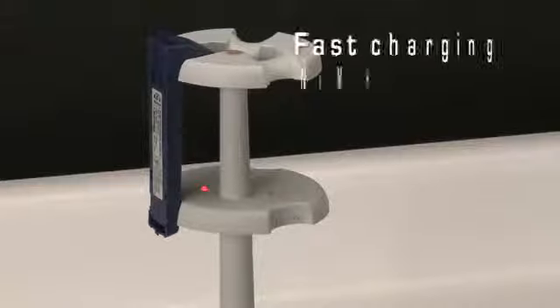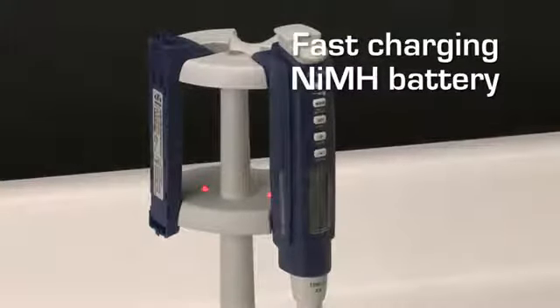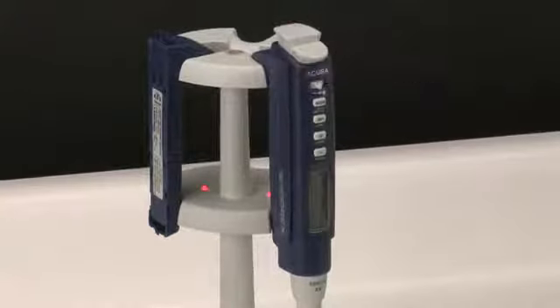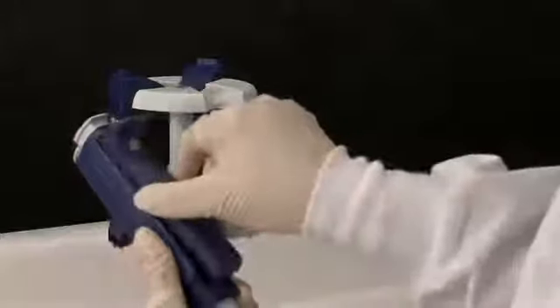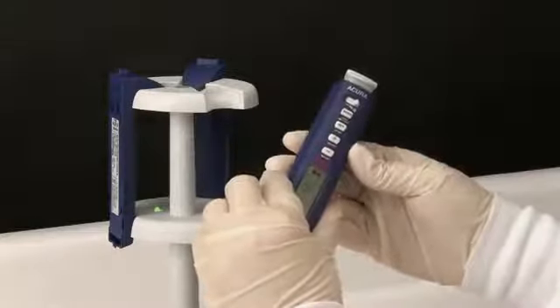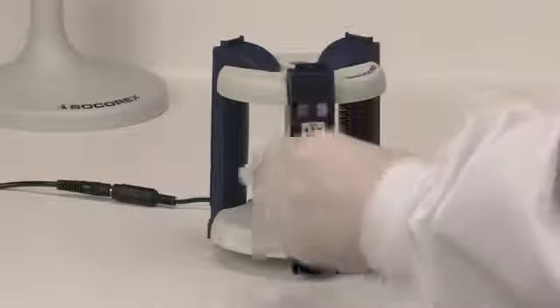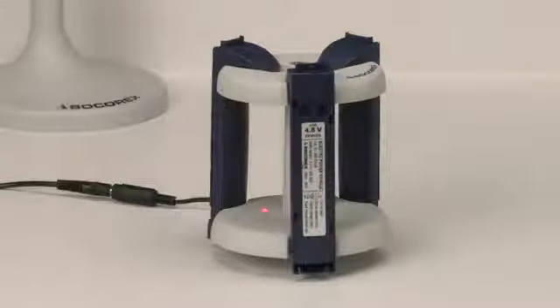Electro pipettes can be charged two ways: charging the pipette together with the battery, or just the battery by itself. When charging starts, the LED turns to red. The spent battery can be easily removed and placed on the charging stand. When charging is complete, the LED light turns to green. The charged battery can be placed on a pipette to continue work without interruption. The accessory battery charging rack can charge up to three battery packs simultaneously.